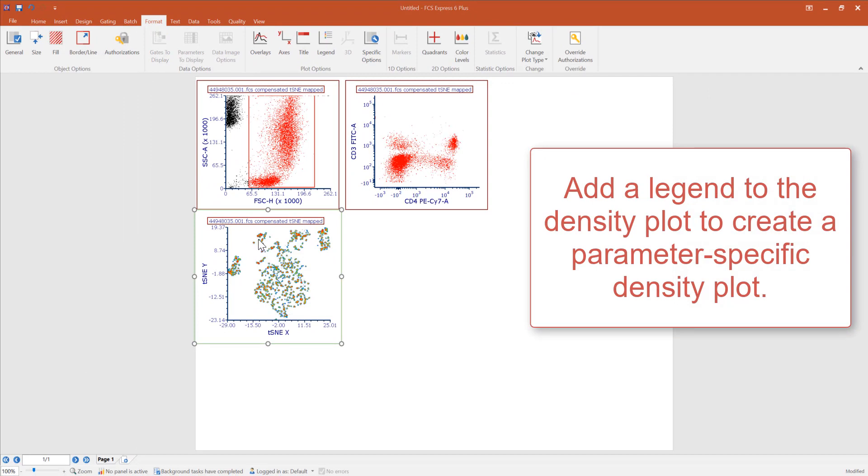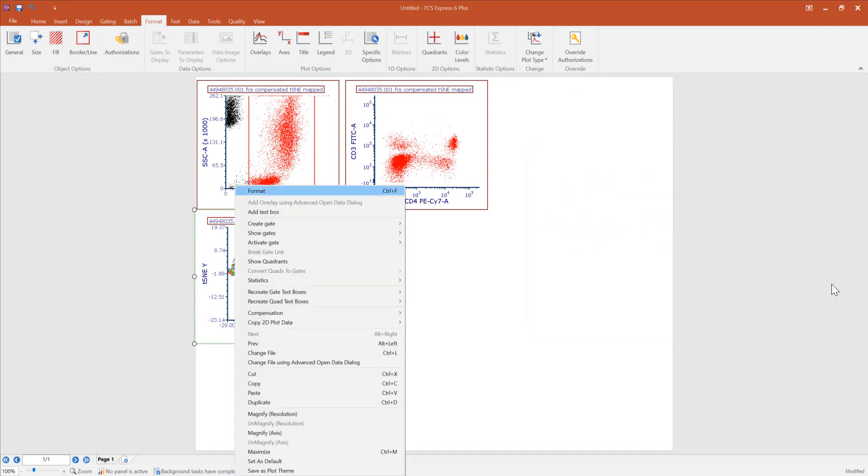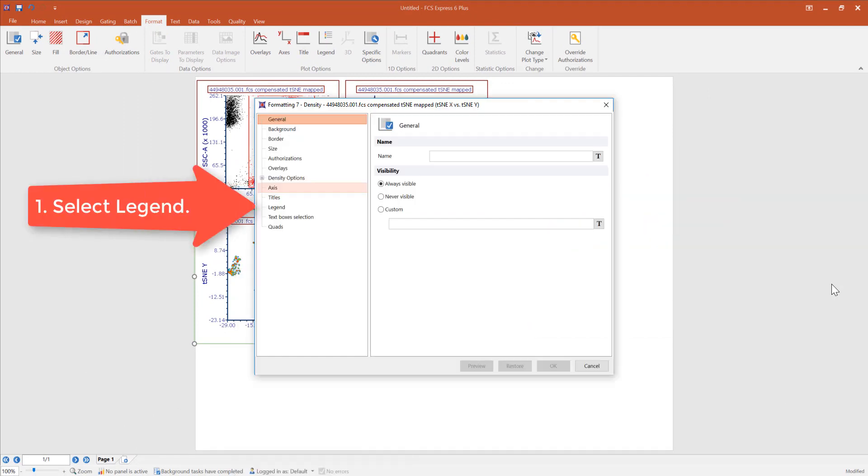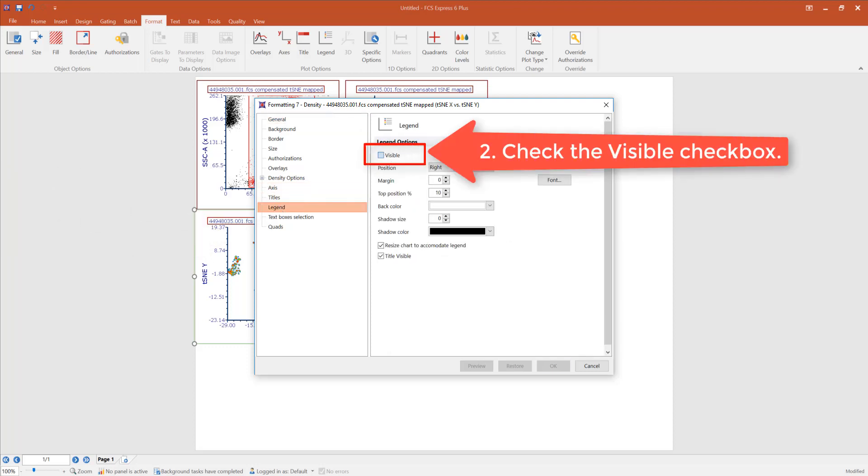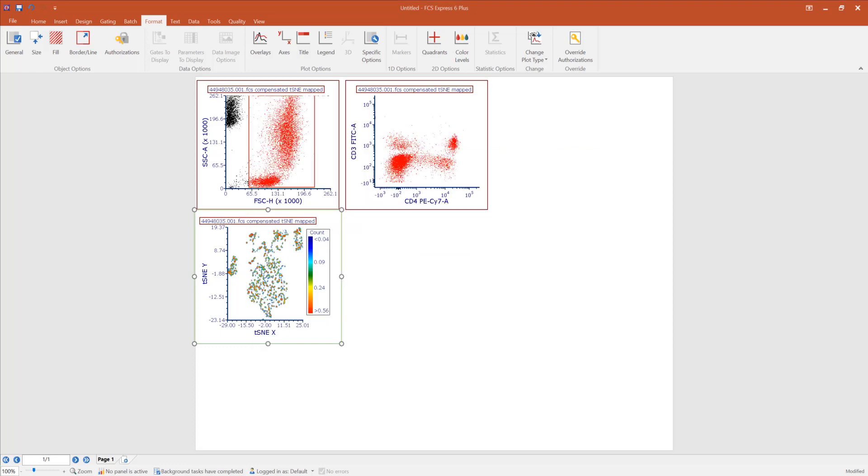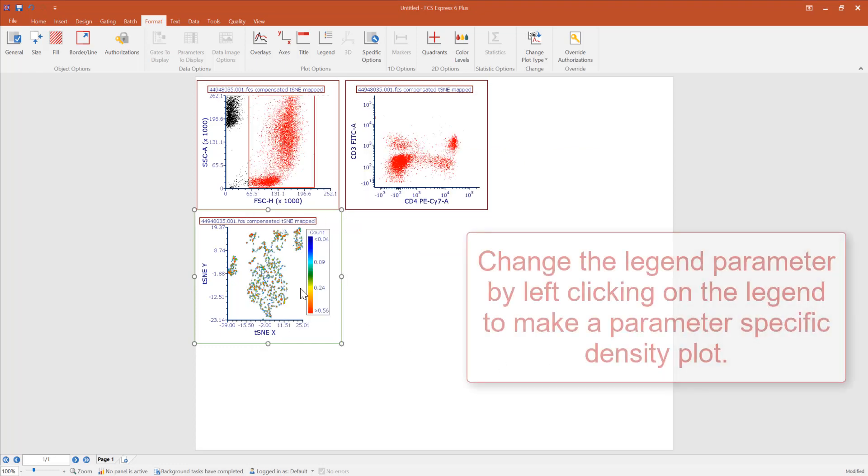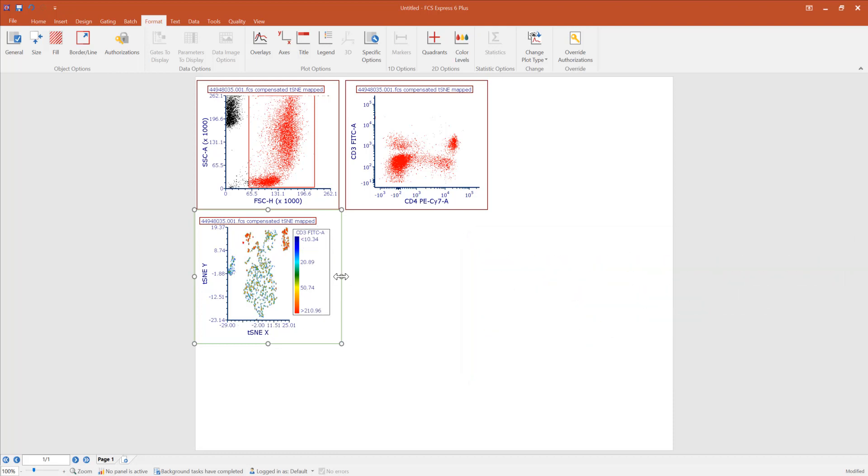To add a specific parameter to a density plot, right click on the plot and select format. Under the legends tab, select visible and click OK to apply. We can now change the parameter of the legend which will update the density heat map to reflect that parameter.